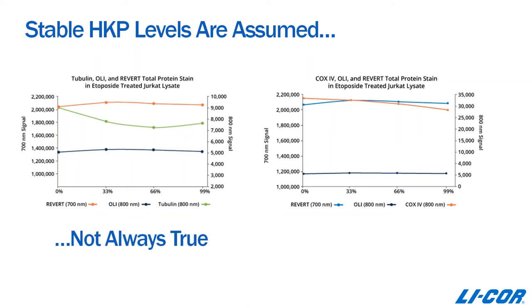What you can see here is that tubulin shows a pretty dramatic decrease in expression level as the amount of treatment increases. COX-4 is affected to some degree, although certainly to a much lesser extent than tubulin. The Revert total protein line is very stable and constant, and the Odyssey Loading Indicator line is a nice straight line too, which means you didn't have any gross pipetting errors that would account for the changes you're seeing. Based on this combined data, you can really conclude that the housekeeping proteins are being affected by the treatment conditions, and in this case neither one would probably be a good candidate for normalizing your data.